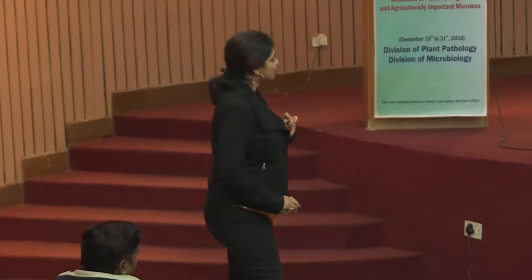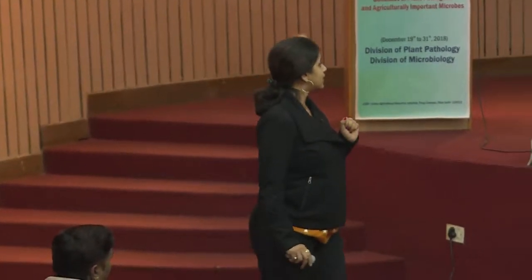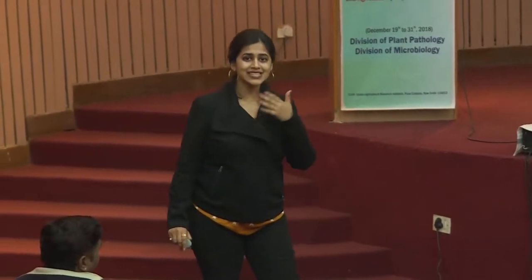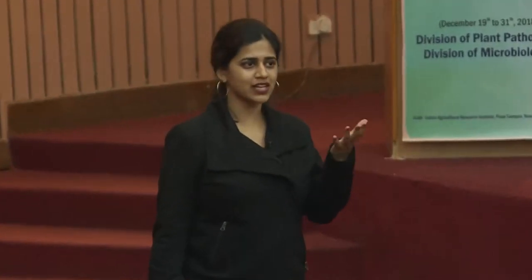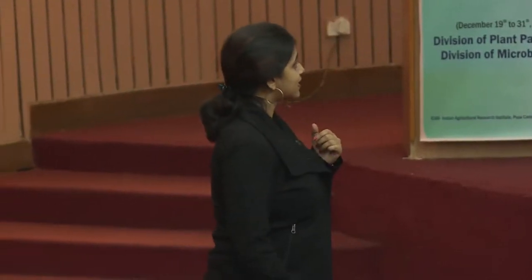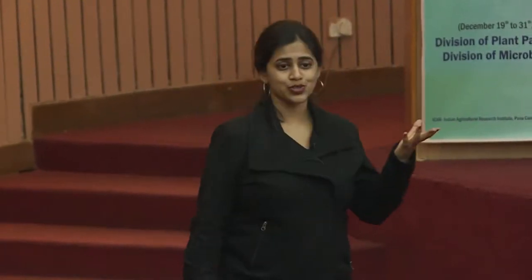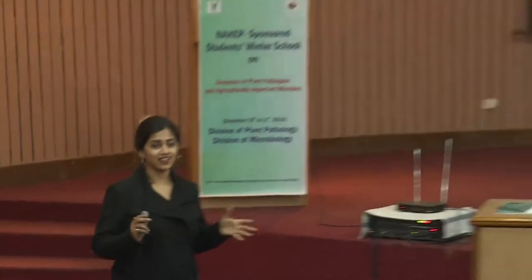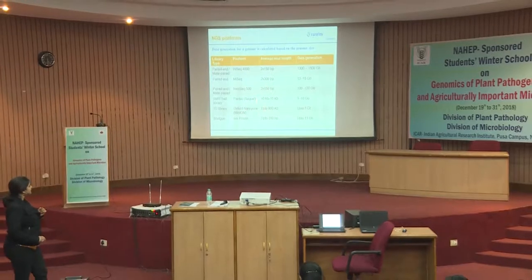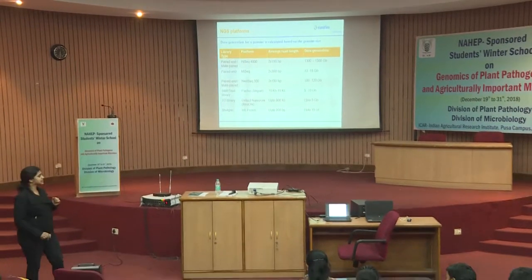We also have a new chemistry coming up in the MinION, which has improved in terms of the error rate, but the error rate is still somewhere around 10%. That's a huge number, whereas the error rate in these other chemistries is only 0.08%. So that is the difference in the error rate of these chemistries, right? So we combine these chemistries together for doing a sequencing.